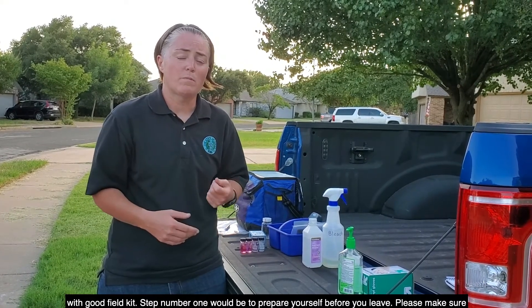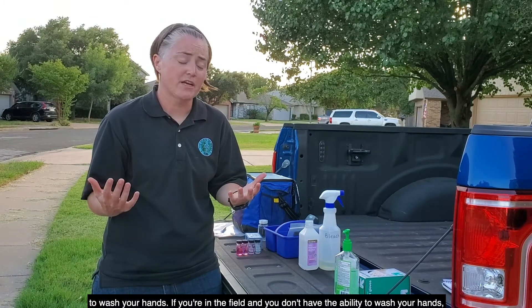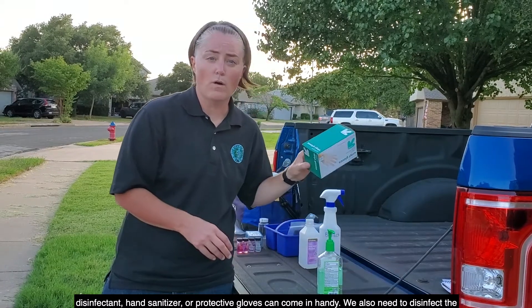Step number one would be to prepare yourself. Before you leave, please make sure to wash your hands. If you're in the field and you don't have the ability to wash your hands, disinfectant, hand sanitizer, or protective gloves can come in handy.